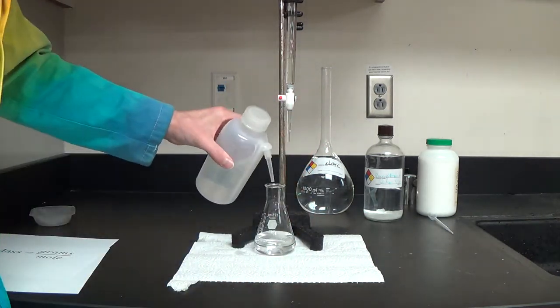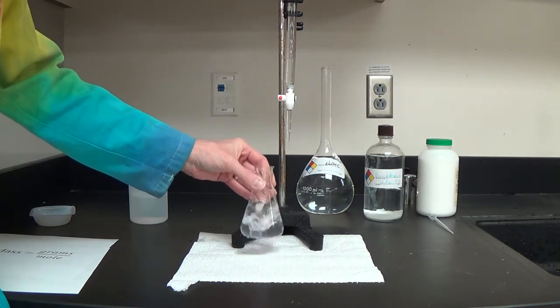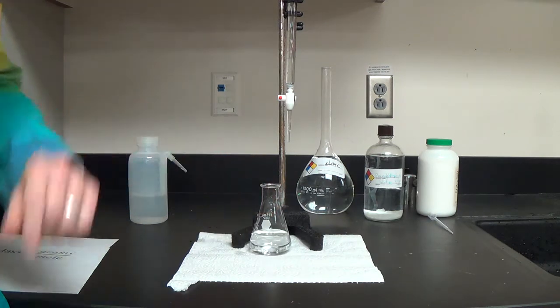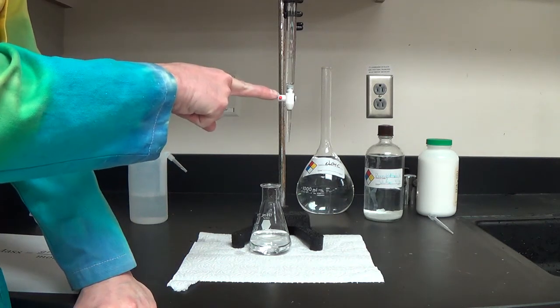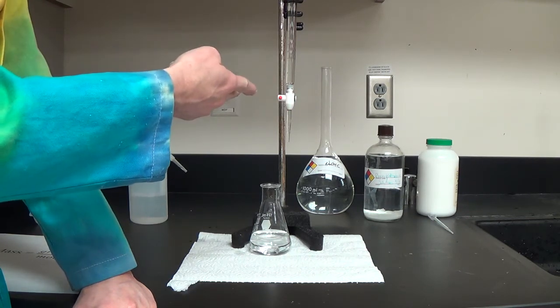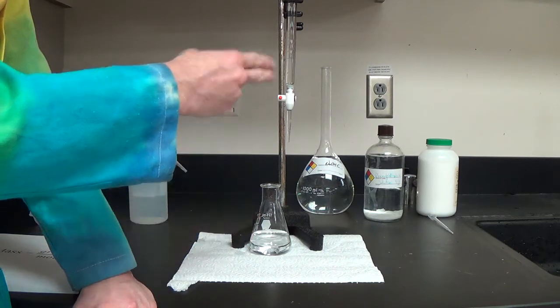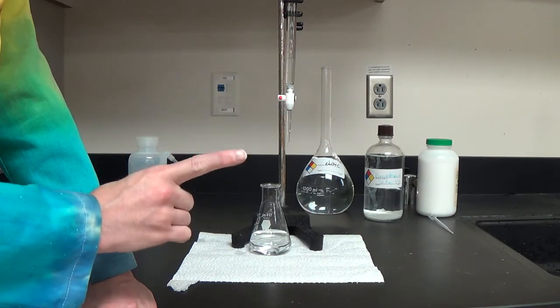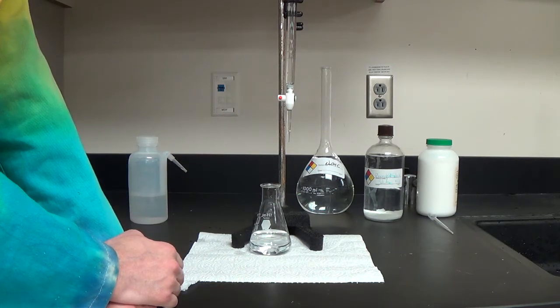I see just a few grains left, so I'm going to add just a little bit more and call that good. I see no solid left, so I'm ready to go. I have my double rinsed burette filled with sodium hydroxide, I have my flask with the solid acid dissolved in water, and I'm ready to titrate. But wait — how am I going to know when I've added enough sodium hydroxide into my flask?